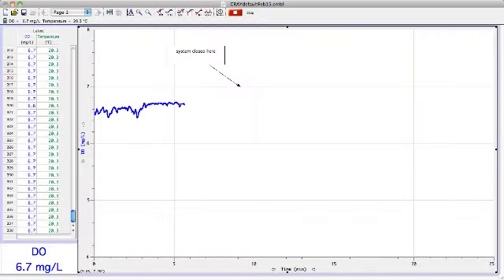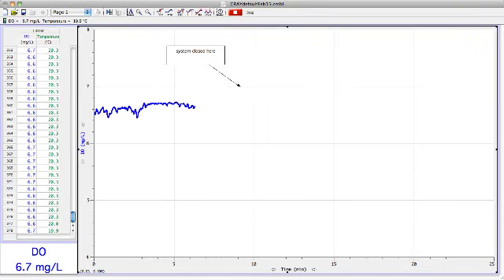And it looks like the baseline is relatively stable, maybe a slight increase that would indicate more oxygen is getting in there, but it's pretty good. So I'm going to seal the chamber now, take the bubbler out. Okay, the bubbler is out. So the system is closed, so I'm going to put my pointer at that point. And we're going to see what happens. If the crayfish is respiring, the slope should go down. So that should probably take a good 10 minutes to get a good rate on that.